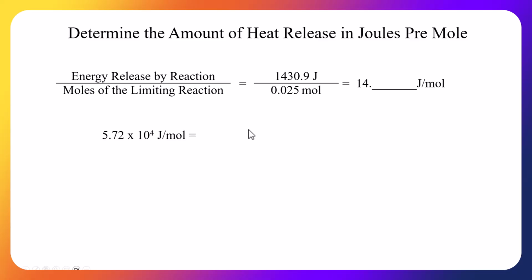Now I'm going to take that number and I'm just going to convert it into kilojoules per mole. And that will be question 14, and that will be question 15. And you notice that the joules cancel out.